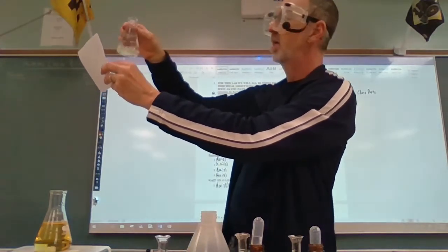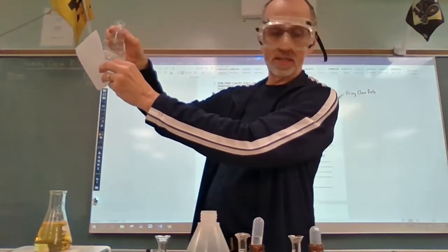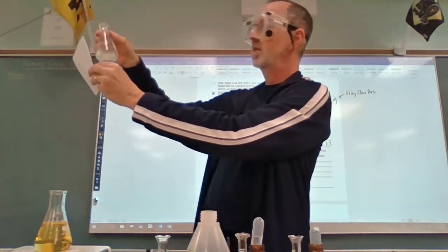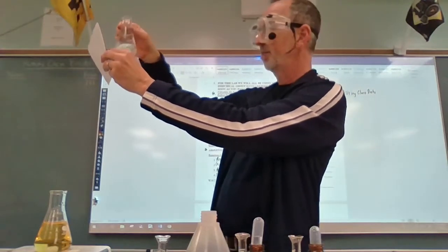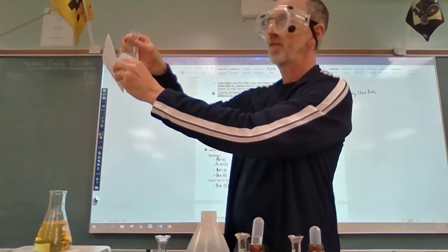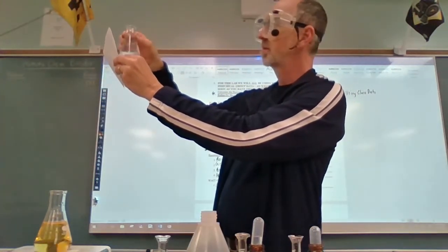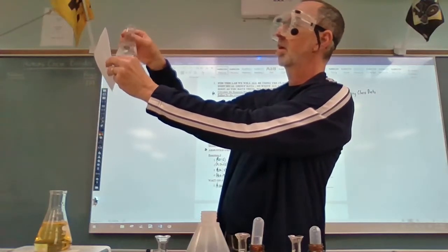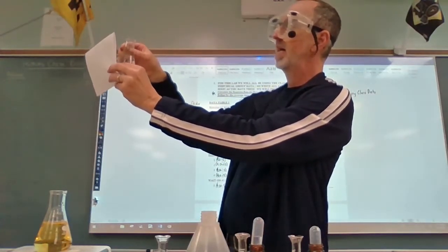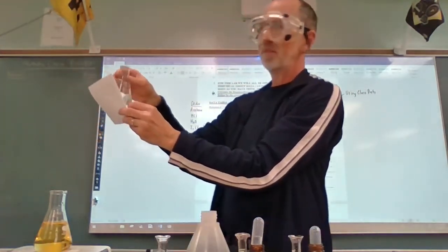The yellowish brown color is more prevalent because we used 10 mLs of it this time rather than 5 as we did before. So this has more iodine comparatively. So my guess is it's going to take longer for this color to fade. Just guessing, of course. Okay. Yeah, it has definitely slowed down from the last two.